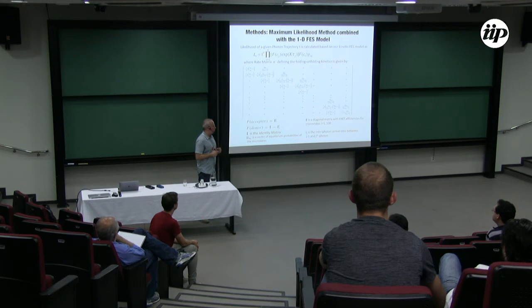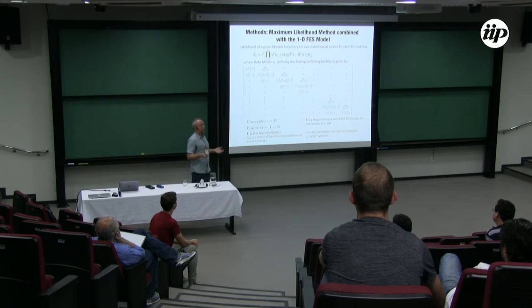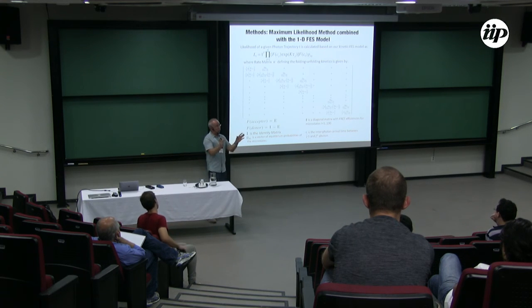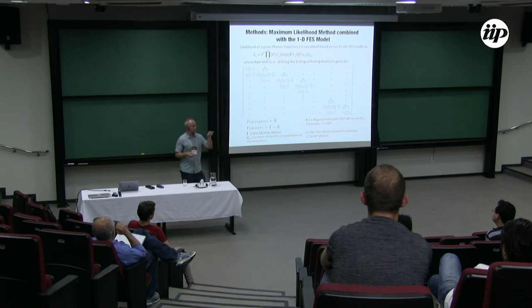No, we haven't done that yet. As I said, what we did is to actually look at the distribution of all the state trajectories, the maximum likelihood state trajectories, and what we saw is that it doesn't recover, as I said before, the original distribution. So that means that it's biased. But it'd be interesting. But this is a very simple model. Remember, there is only one pathway because it's one-dimensional, right? So the only differences are going to be how much is jumping, whether it's staying there longer, and things like that. So most likely, the differences are going to be mostly on the dwell times, basically on the bottom of the minima, not so much on the barrier, because the time it stays there is not that much. Right?